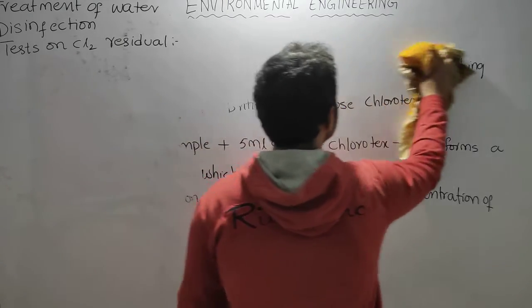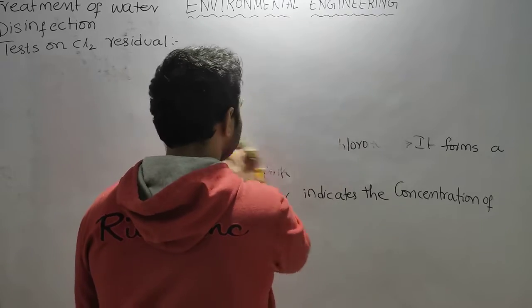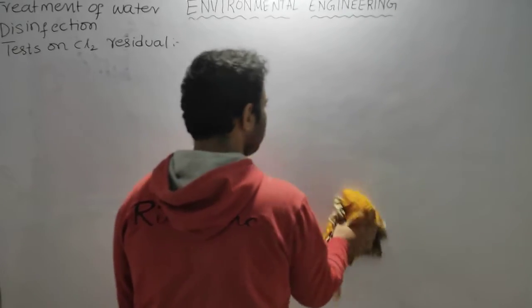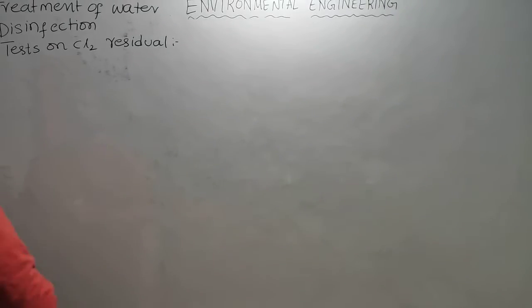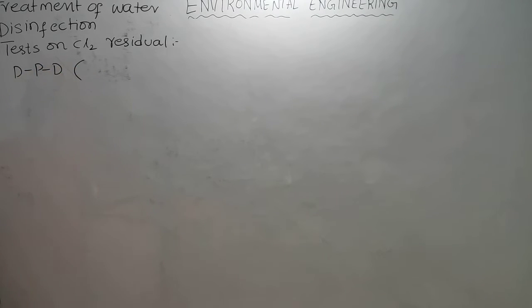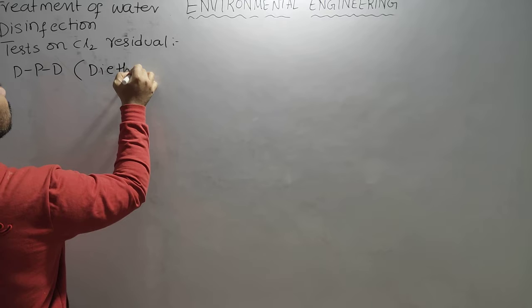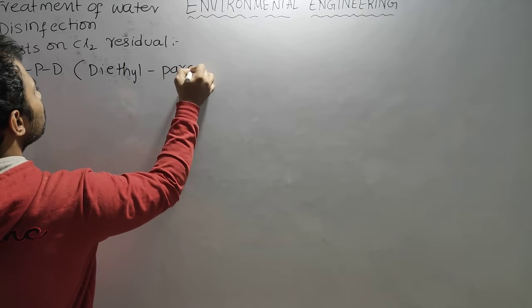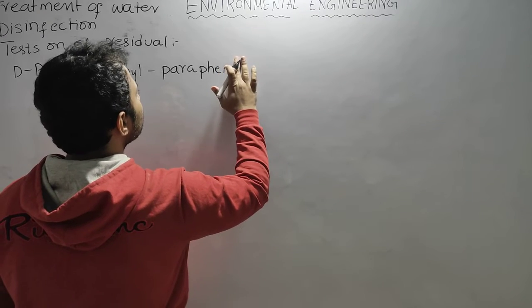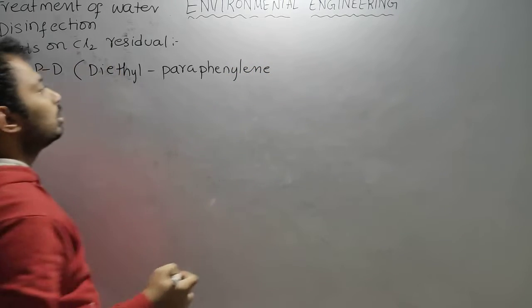Next is the DPD test, diethyl paraphenylene diamine.